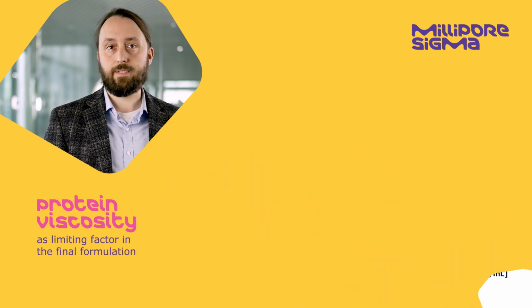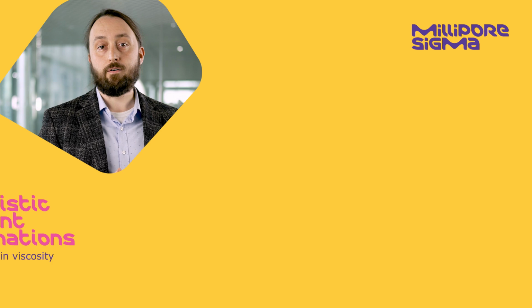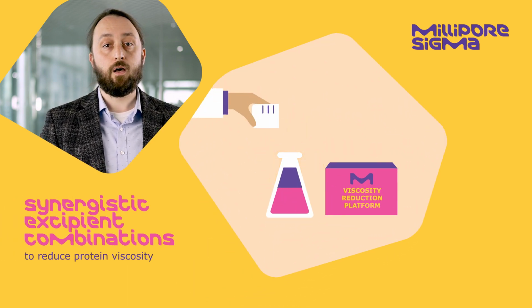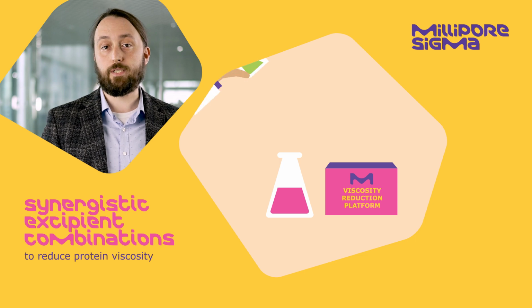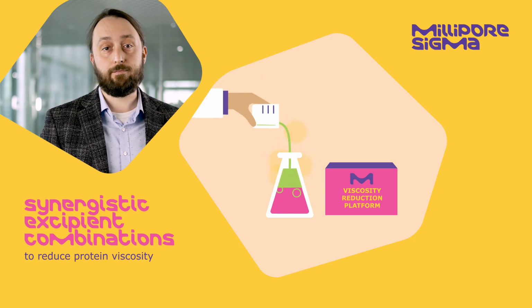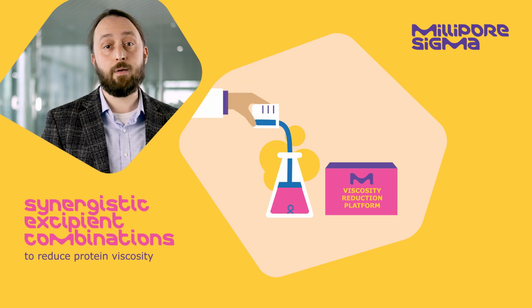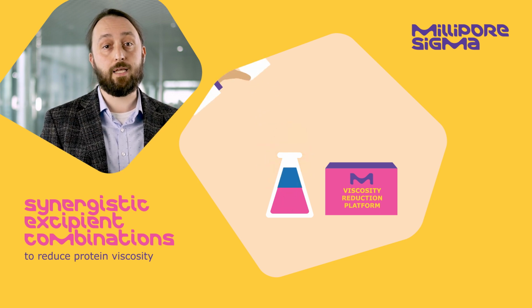So how can we overcome this issue? Let me tell you how we went about it in my lab to find a solution. First of all, we looked at the effect of different excipients and excipient combinations on proteins, on antibodies. This is important because the factors and the forces that cause protein viscosity on the one hand are the same that cause the protein to be stable as well. And this has led us to an important conclusion.